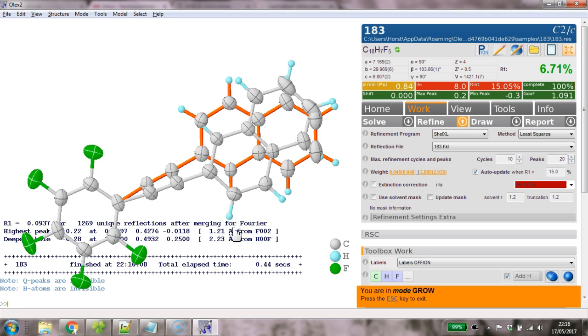And I think this is quite an easy way to do it. And I would like some feedback on this part V, the PV. We also got this for part one and part two and so on. If you've got any ideas, let us know. Thanks for using Olex too.